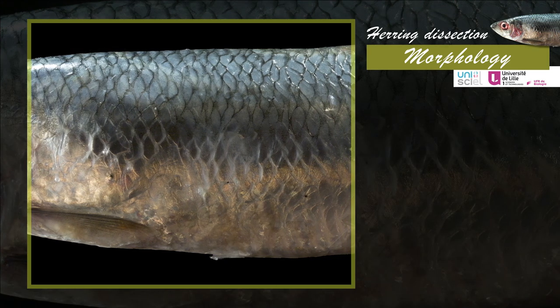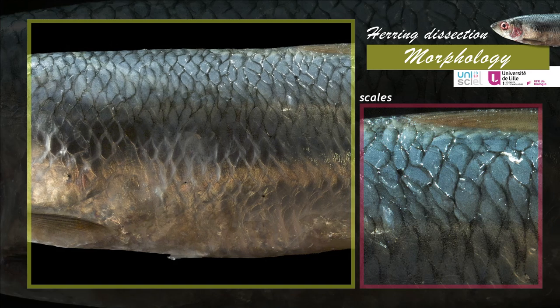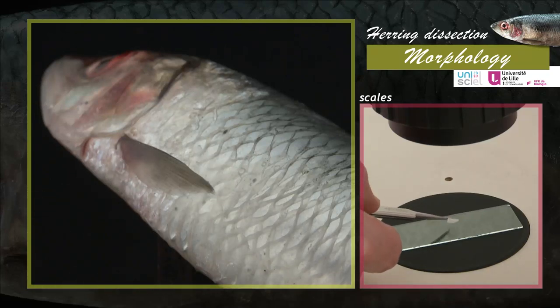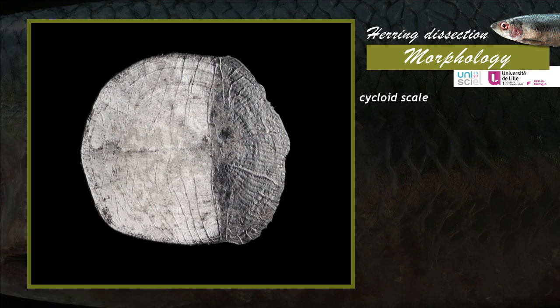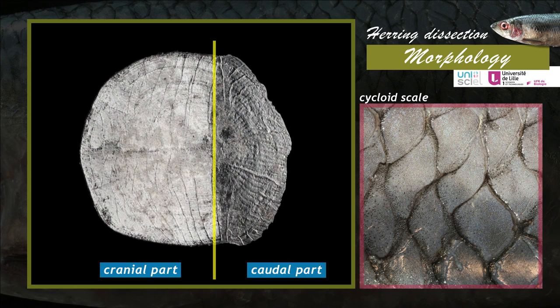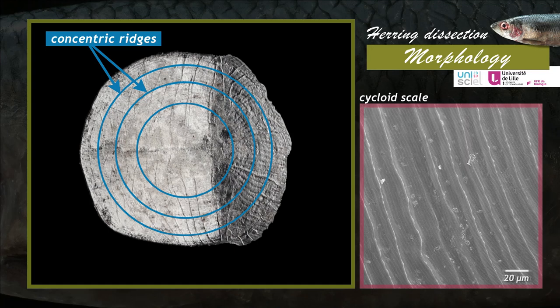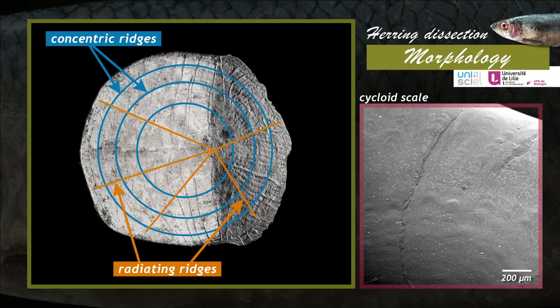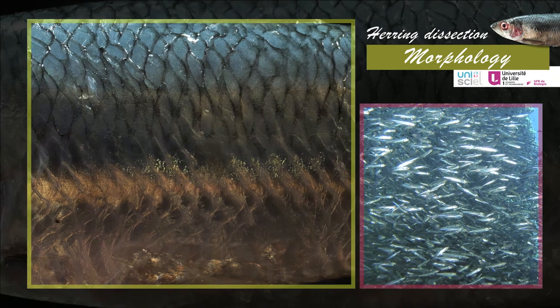The herring's body is covered with bony dermal scales. These scales, thin and flexible, overlap one another in a head-to-tail direction. The scale structure can be observed using the binocular microscope. The herring scales are called cycloid because of their rounded outer edge. The cranial part of each scale is covered by the caudal part of the previous one. The scales are covered with concentric ridges of different sizes as well as radiating ridges.